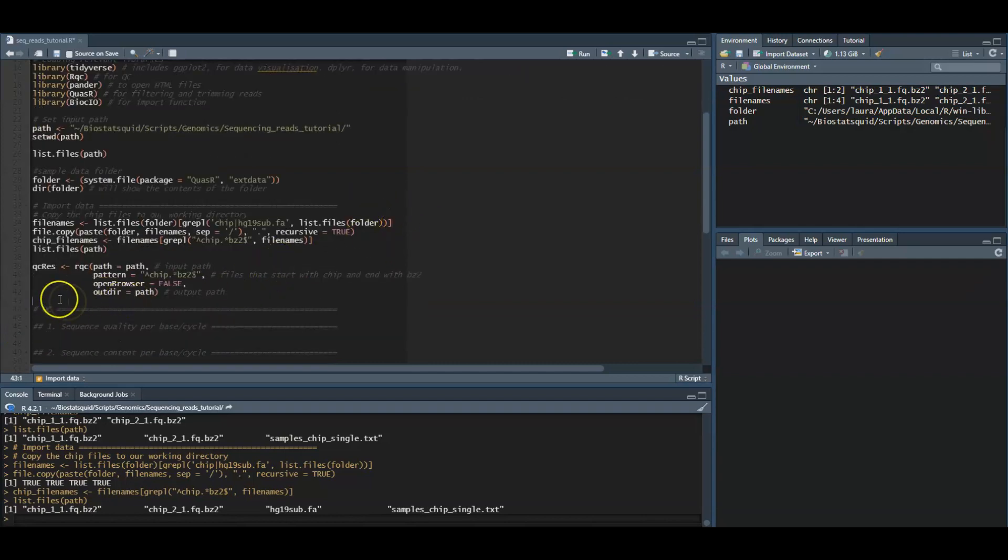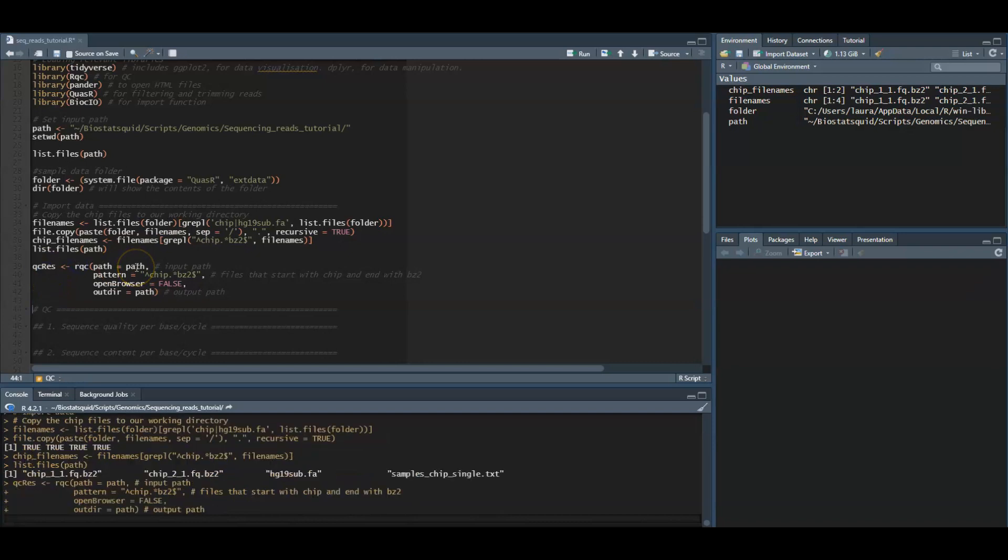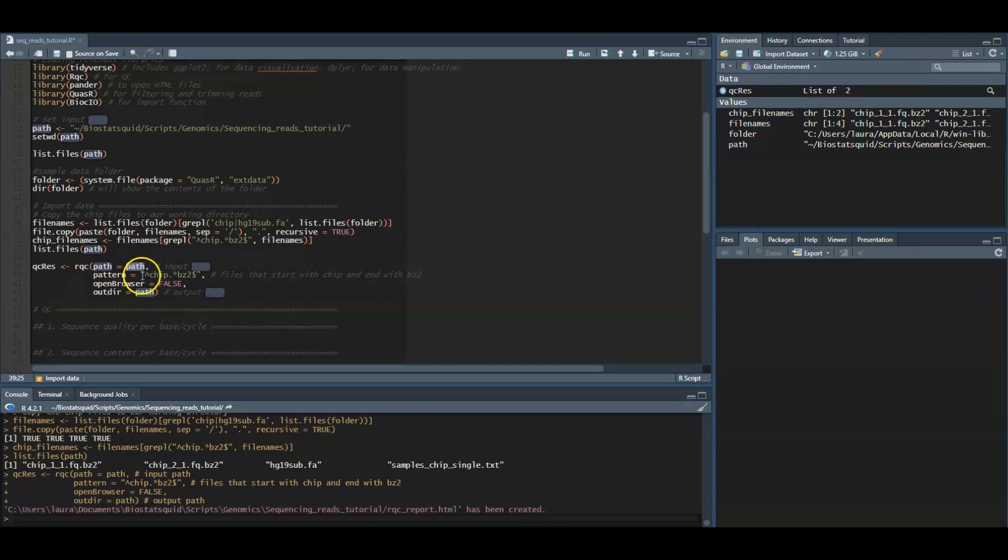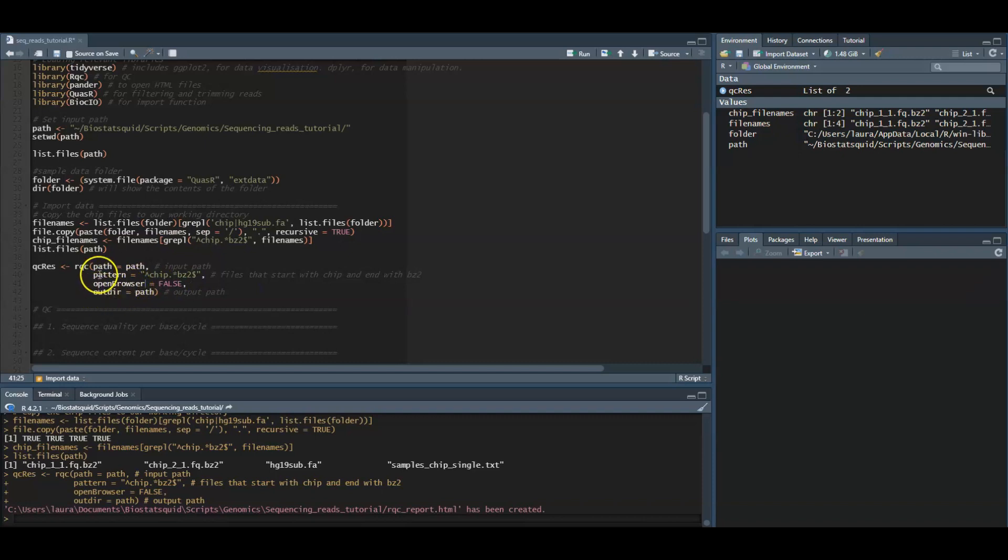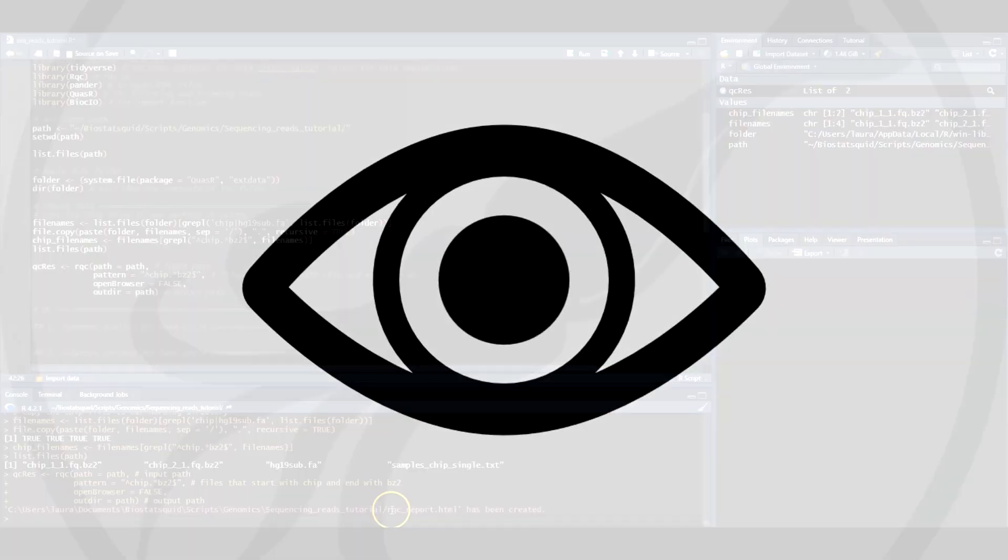We will assign it to this object QC results and we need to give it our path, a pattern which tells it which files to select—in this case files that start with chip and end with bz2. We don't want to open the results on the browser but we want them saved in our path. And as we see the report has been created. This created quality control metrics and assigned them to this object. Obviously now we want to visualize these quality control metrics.